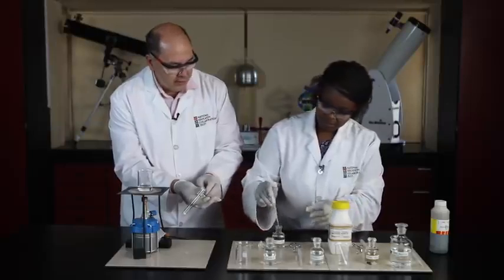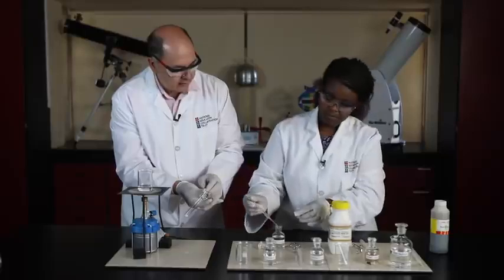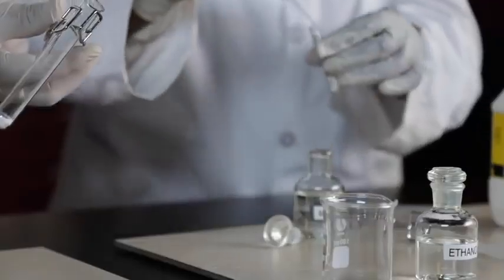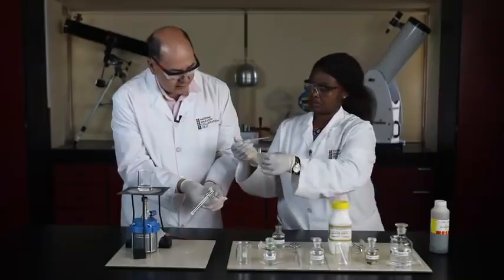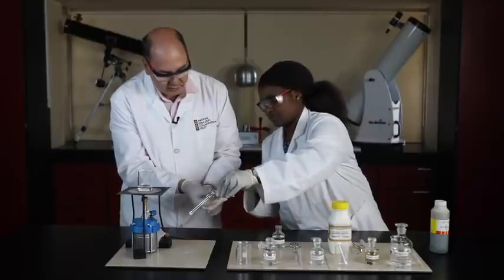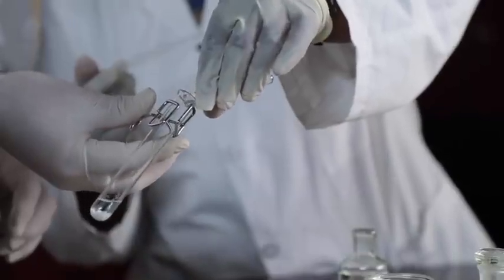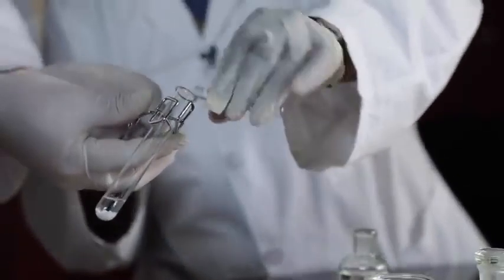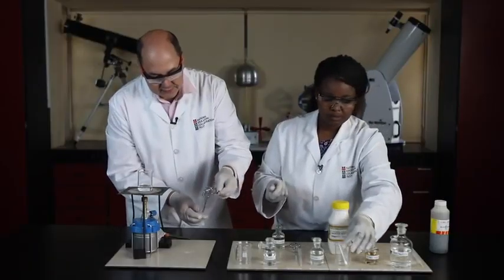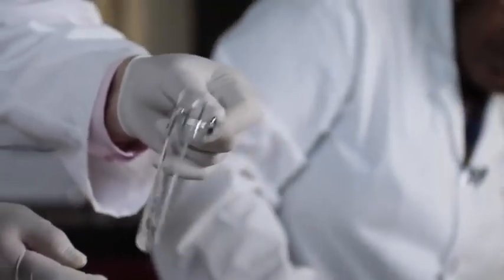So take 3 mLs of the methanol, add it to the boiling tube. There we go. Shake it around. Now make sure that it flows down so we can get all of that stuff. That's it. Beautiful. Lovely. Okay, you'll see that the acid hasn't totally dissolved, but I'm swirling it, more or less dissolved. All right.